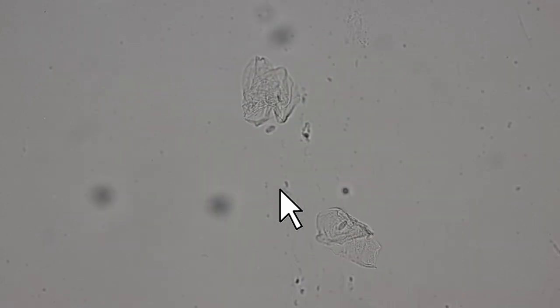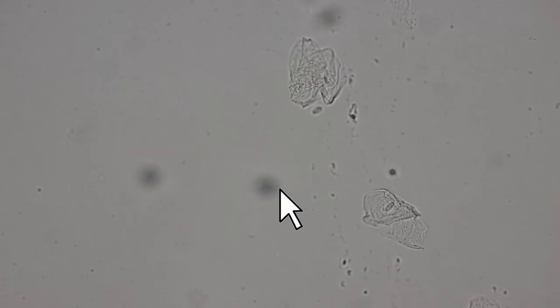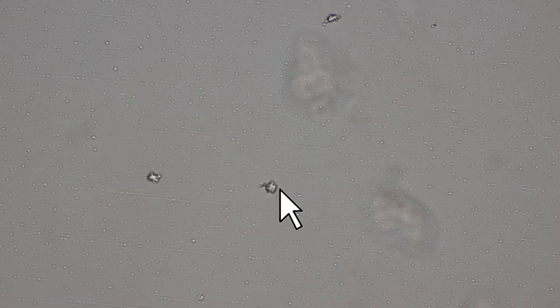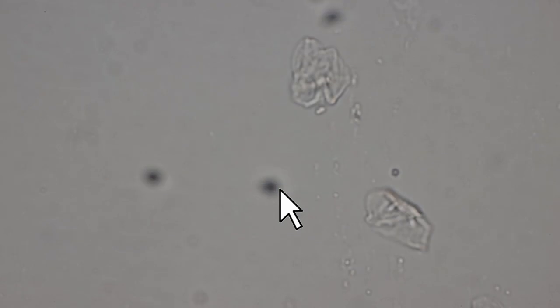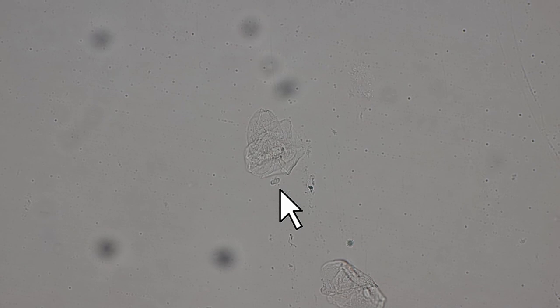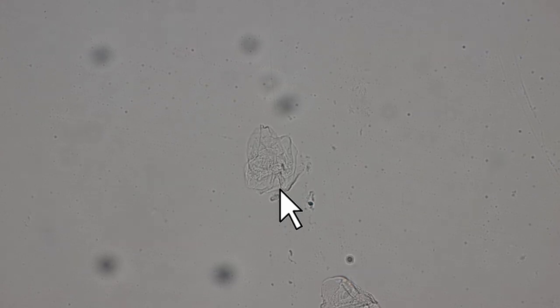Forget all of those gray dots here in the background, okay? All of those gray dots, which are out of focus, it's all dust and dirt. What is this? I don't know, it's something on the slide. And you see that there are streaks, so this slide has not been properly cleaned. But here we go. These are basically skin cells, of course. Epithelial cells of the inside of my cheek. Just wanted to say that they are flat as many of the skin cells.